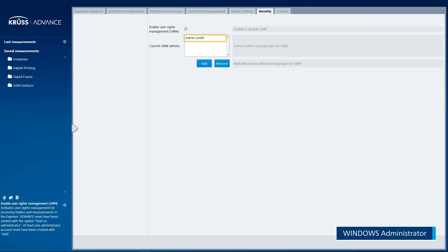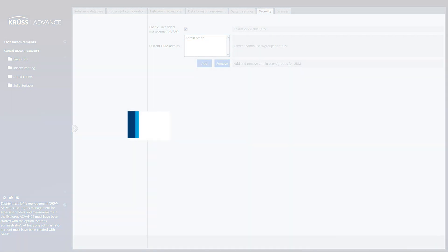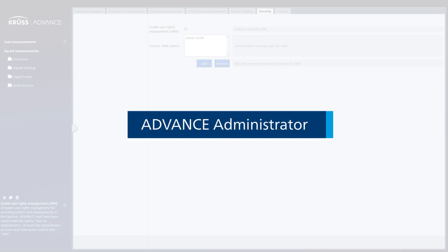Once the first Advanced Administrator has been created, you no longer need to run Advanced as a Windows Administrator to use User Rights Management. We will continue from the Advanced Administrator view.